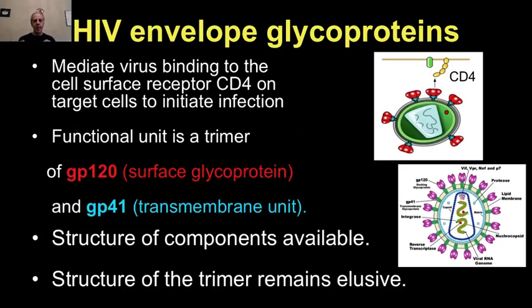And you could think of it maybe as a flower that is opening and then trying to latch into the CD4. And once again, it's very important to understand how this conformation is latching, how it's contacting, how it's basically managing to grab the CD4, and are there any changes happening when that's going on.